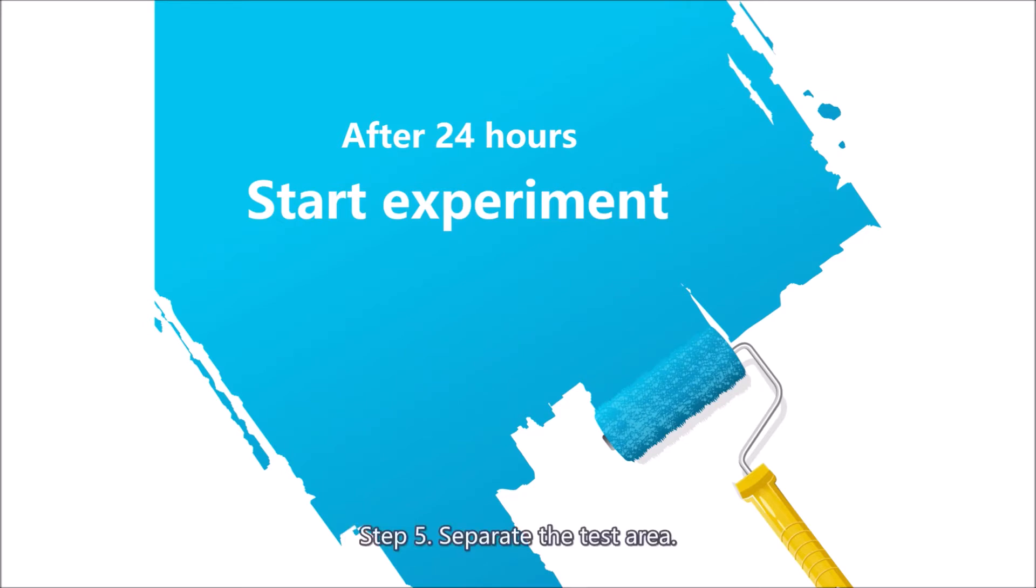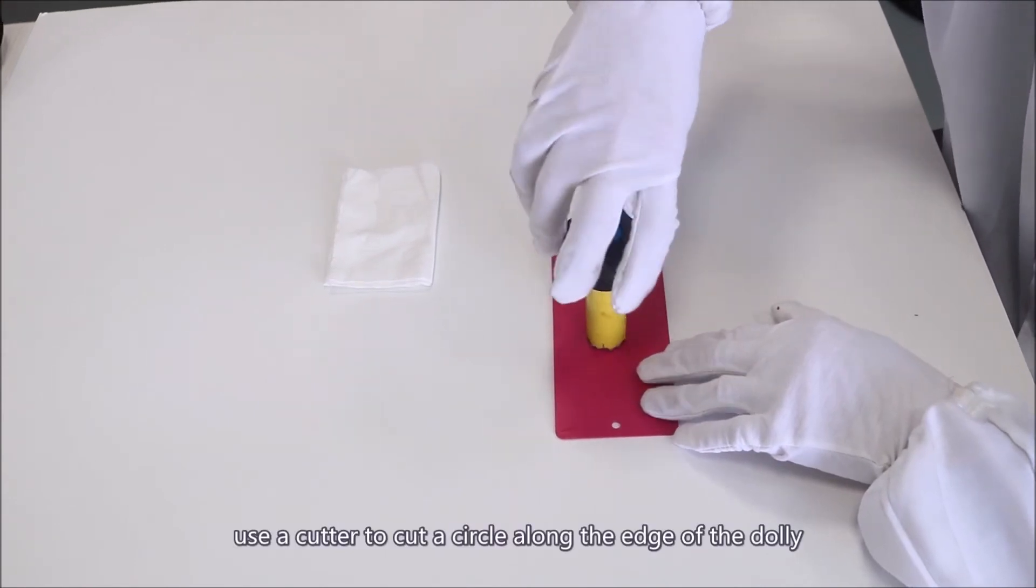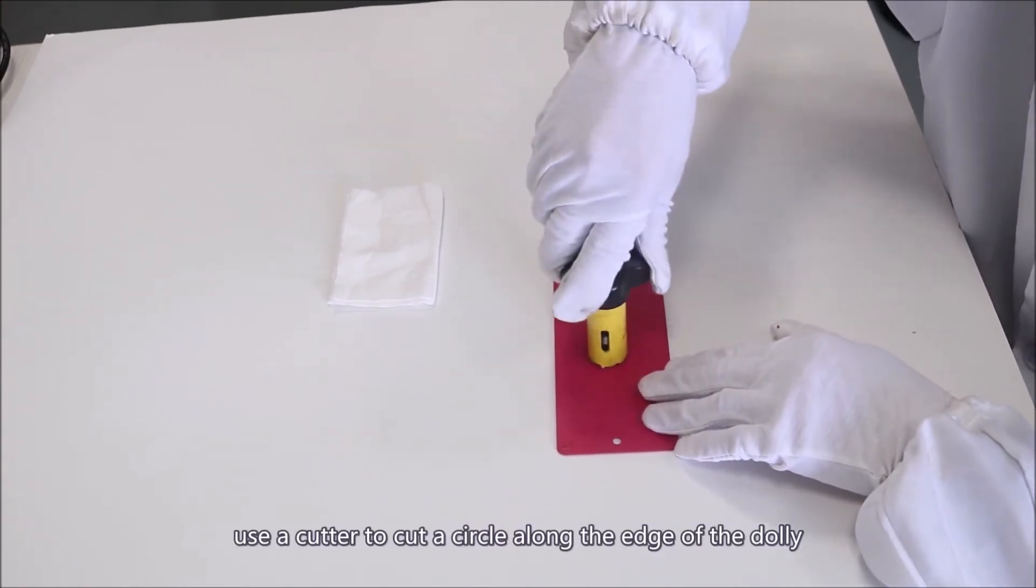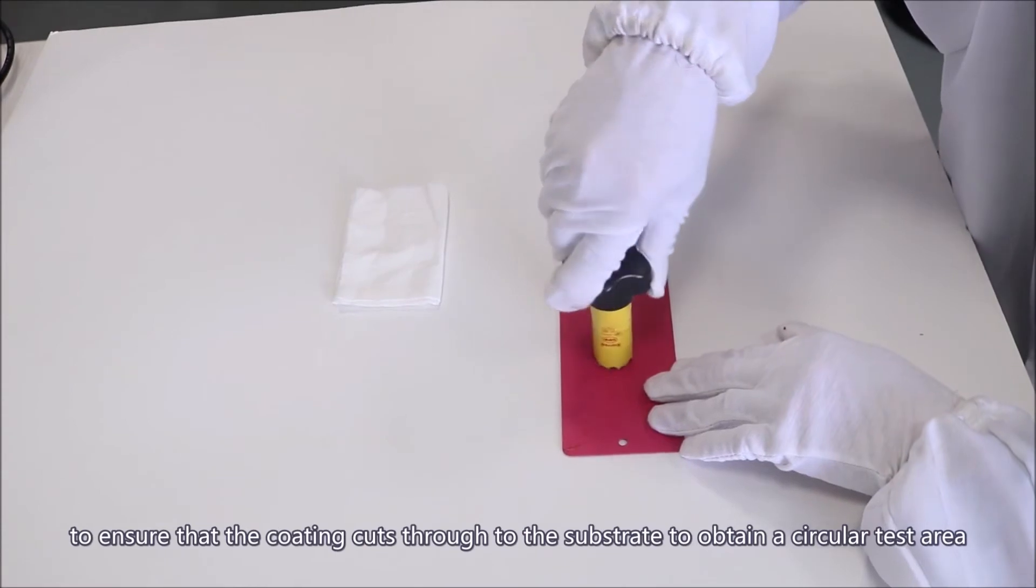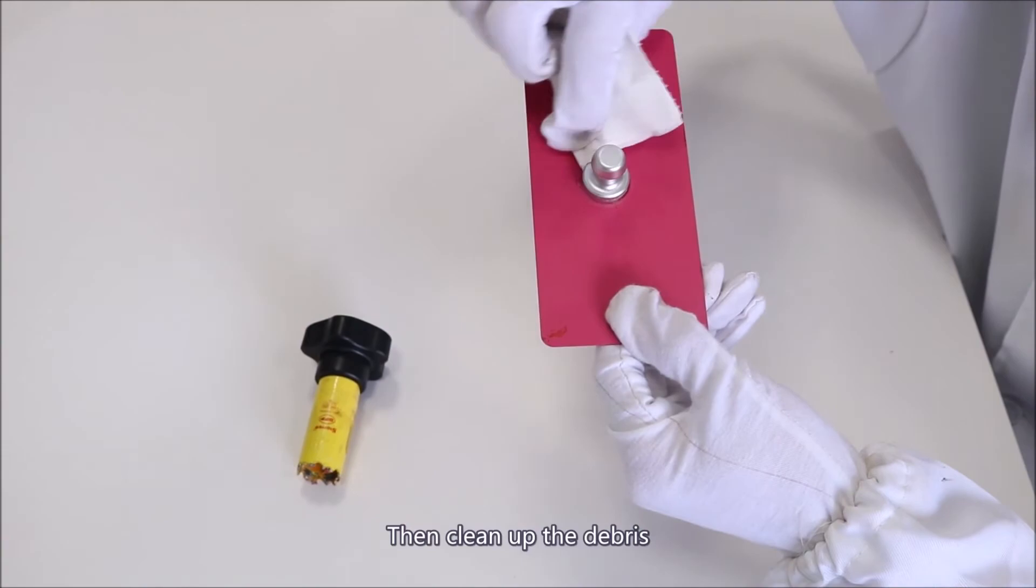Step 5: Separate the test area. After the adhesive is completely cured, use a cutter to cut a circle along the edge of the dolly to ensure that the coating cuts through to the substrate to obtain a circular test area. Then clean up the debris.